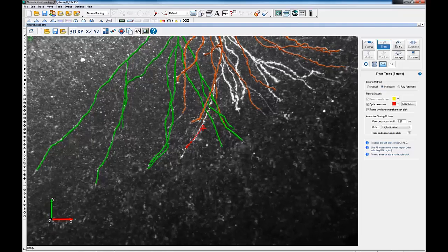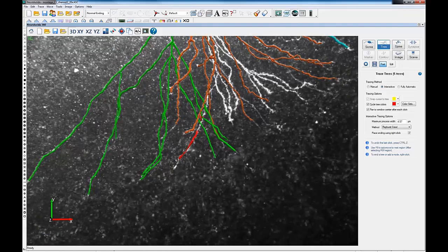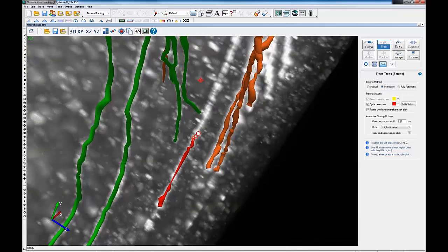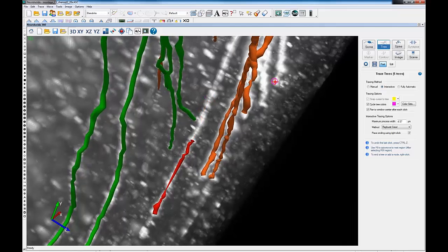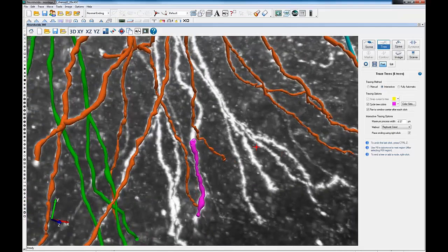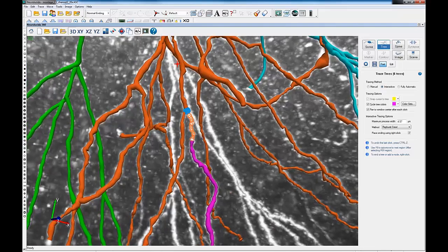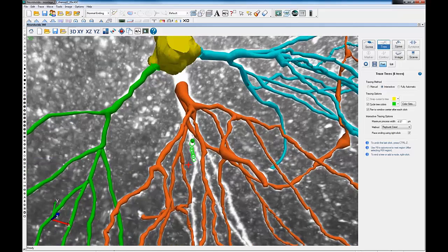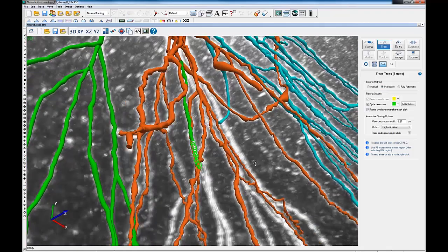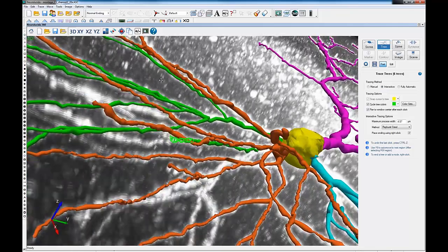And depending on the tissue or the species, what I usually do is locate my region of interest on a 10x objective. And I use a water immersion system. There are other systems, but I like to have the water immersion. I feel I can get the best optics that way, as opposed to a regular air objective. I'll find my region of interest with a 10x objective, and then when I do my mouse work, I'll move to a 20x or 40x.